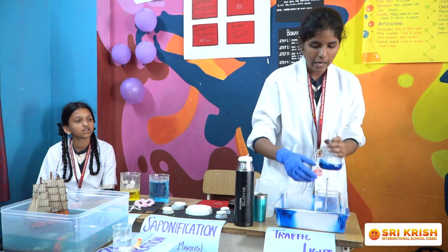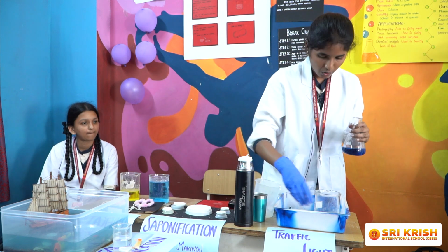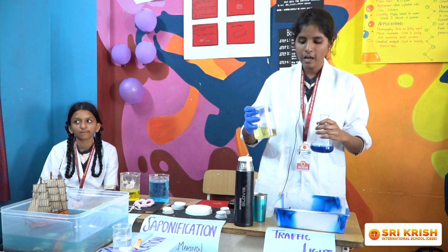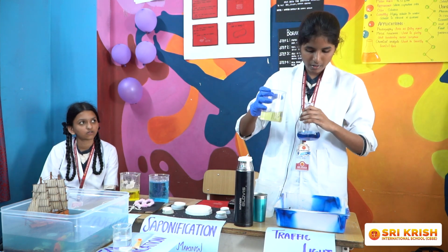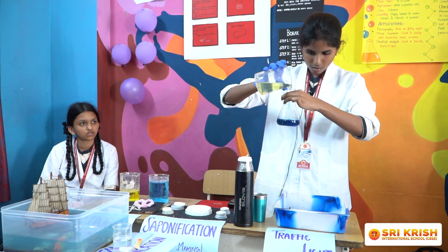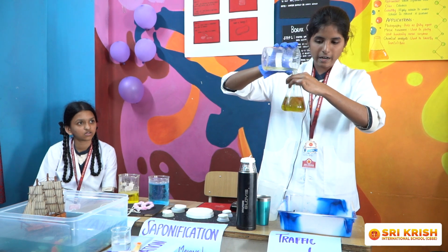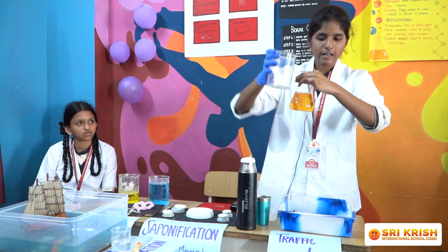The indigo carmine first reduces to form green color. This alkali solution reduces the indigo carmine. It turns green first, then it turns red, and lastly it turns yellow.